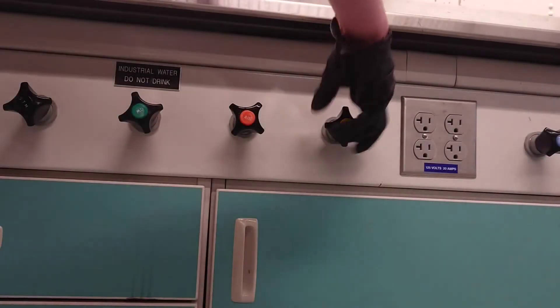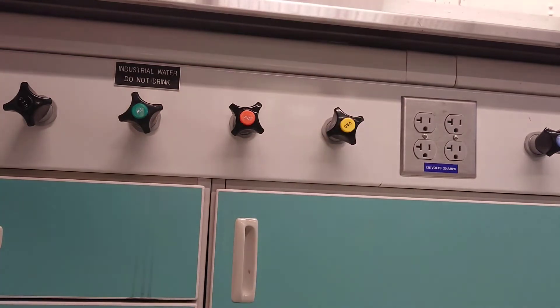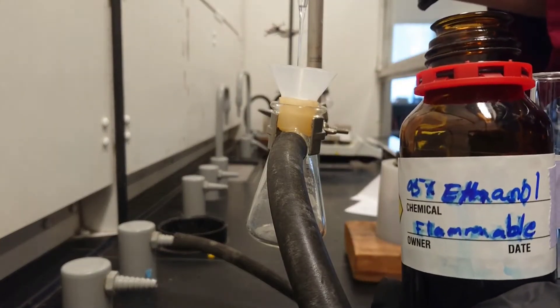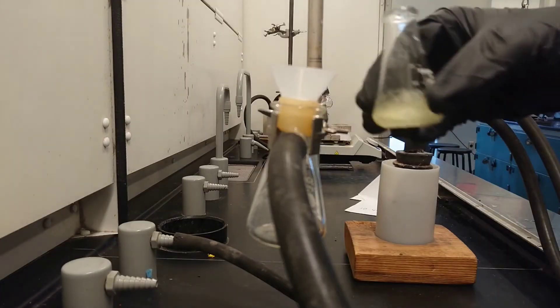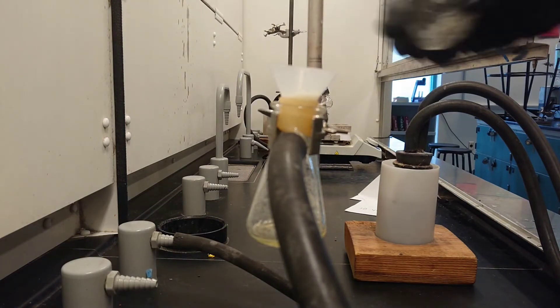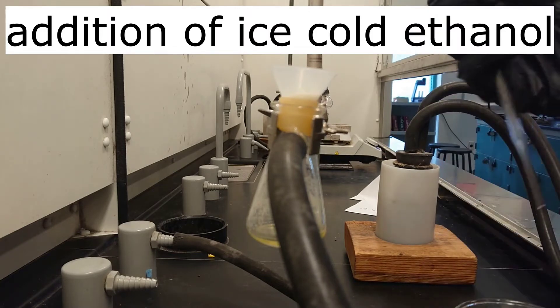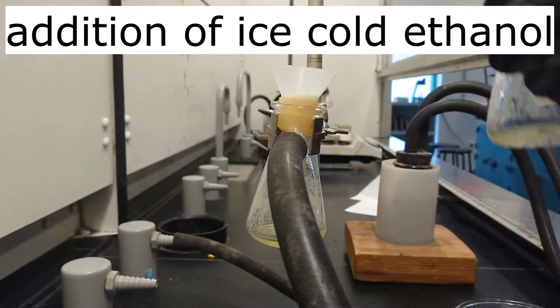Turn on the vacuum. Wet the filter paper with solvent. Whirl the flask to disperse the crystals throughout the suspension, then quickly pour the suspension into the Hirsch funnel. Use ice-cold solvent to rinse the remaining crystals into the Hirsch funnel.